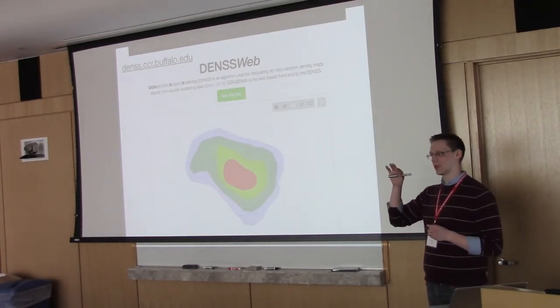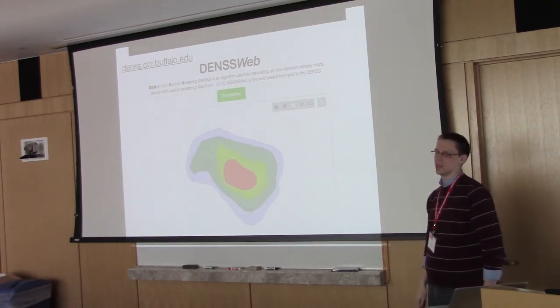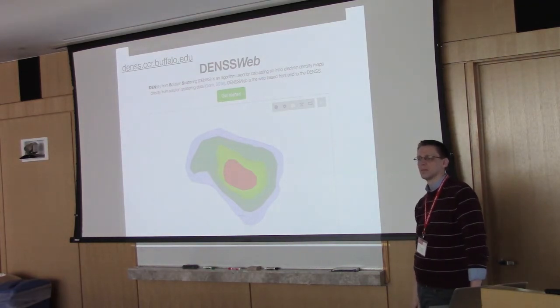But what'll happen is, it'll be a shock to the system when you remove all these things, but it'll eventually get back to where it fits. And it does a pretty good job. So like one example where you had this low density lipid tail within the protein densities. So did you have any problem assigning the connectivity restraint there?